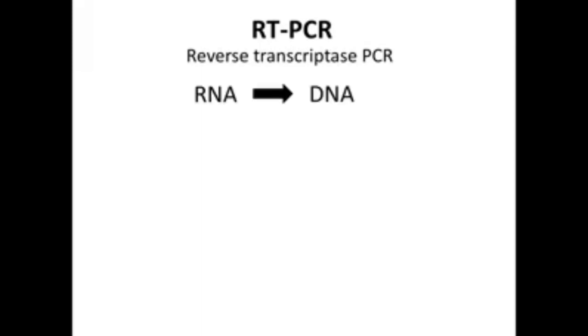Other kinds of PCR usually used are the RT-PCR, or reverse transcriptase PCR. In that, we use an enzyme called reverse transcriptase to convert RNA into DNA and later amplify it with PCR.